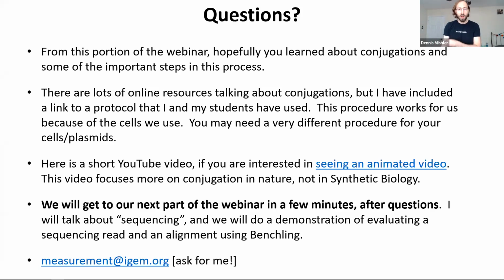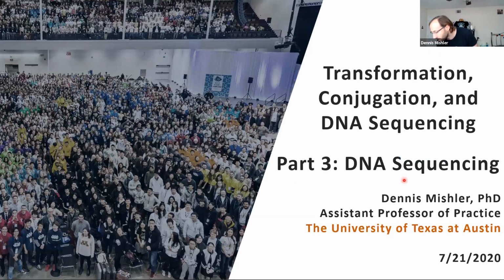Happy to answer. For the last part of our webinar day, we're going to go into sequencing here. Let me go ahead and move us forward to sequencing. And so we're going to talk about DNA sequencing here, and we're actually going to also do a live demonstration looking at it a little bit. I'll get online and do some stuff there with you. So part 3, DNA sequencing.